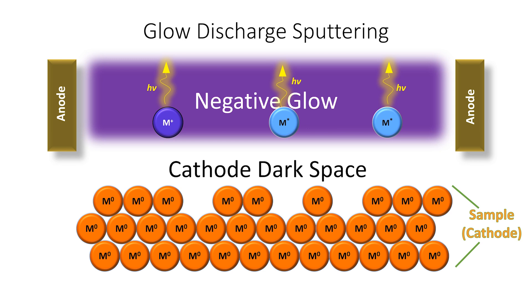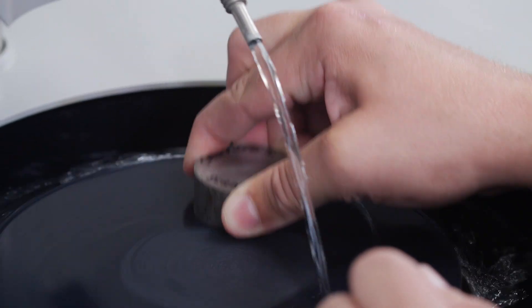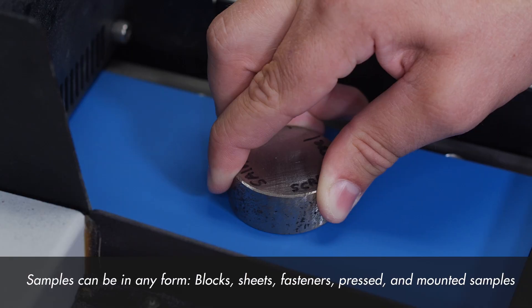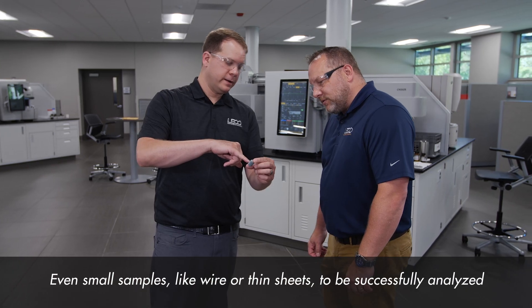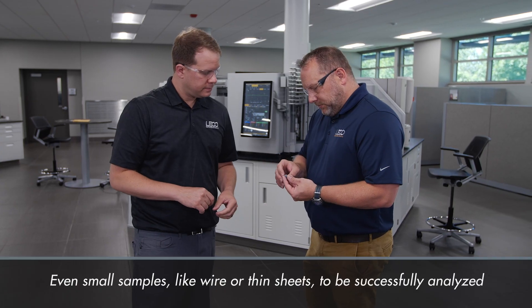The Glow Discharge method of spectroscopy is well suited for bulk applications to determine the average elemental composition of a sample. Samples can be in any form, such as blocks, sheets, fasteners, pressed, and mounted samples. A variety of sample holders allows even small samples, like wire or thin sheets, to be successfully analyzed.